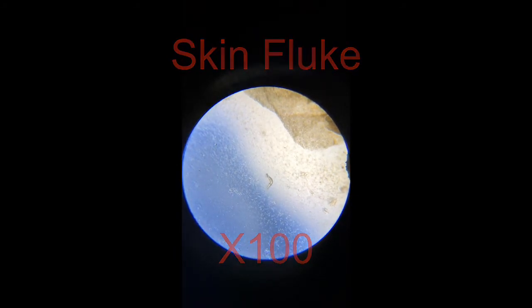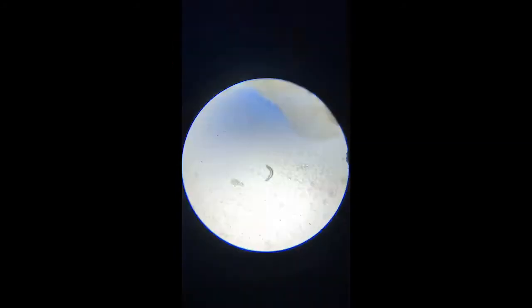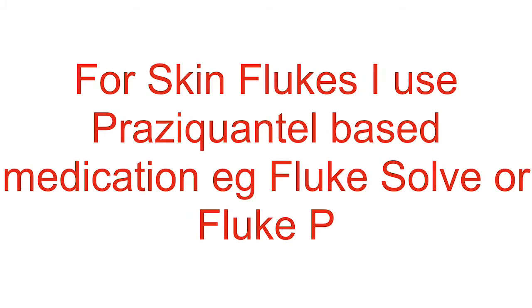This is skin flukes on times 100. I use the special skin flukes treatments because they don't affect the biological filter and they're very effective.